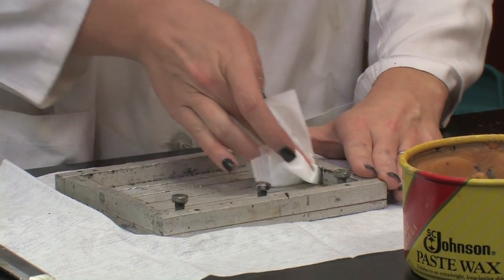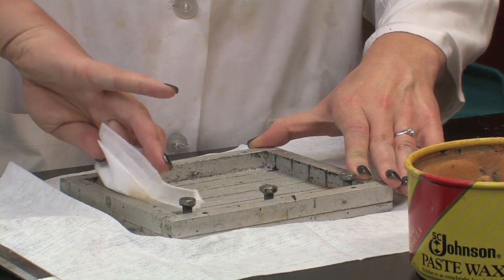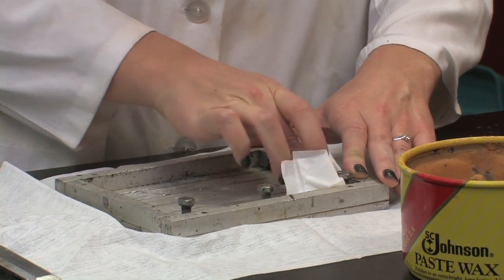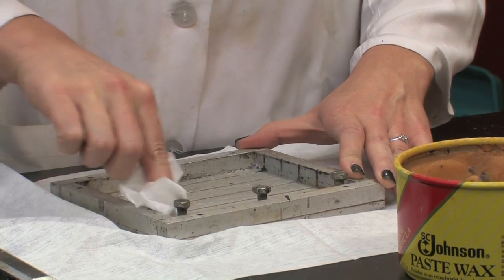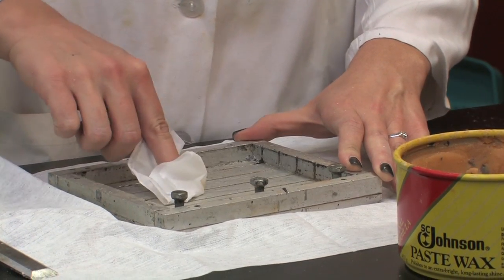Apply a thin layer of the wax all over the mold, on the walls, in the corners, and in the ridges. Avoid any buildup of wax though. You just want a thin layer to coat it.